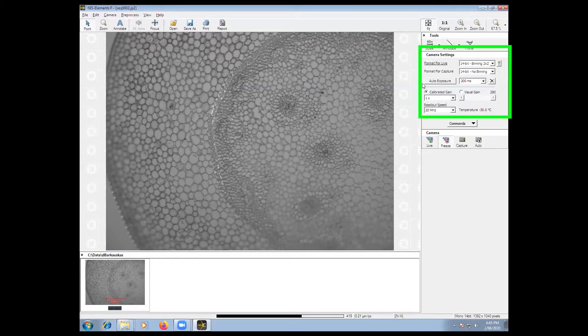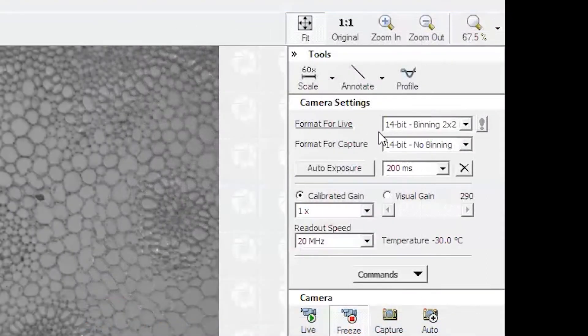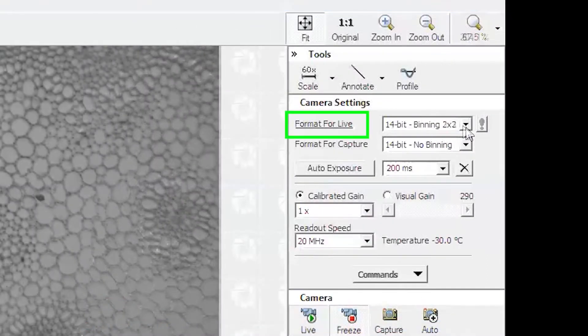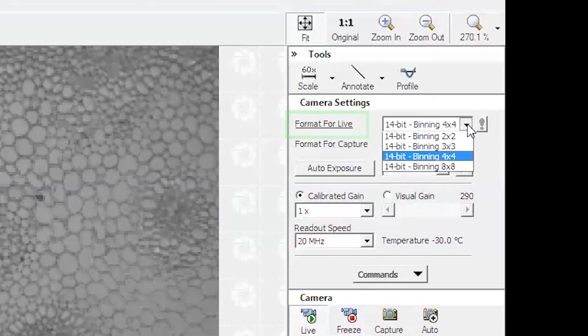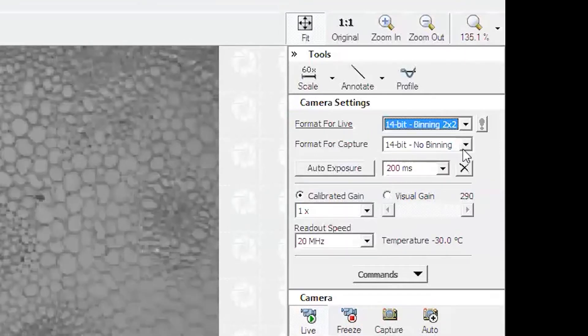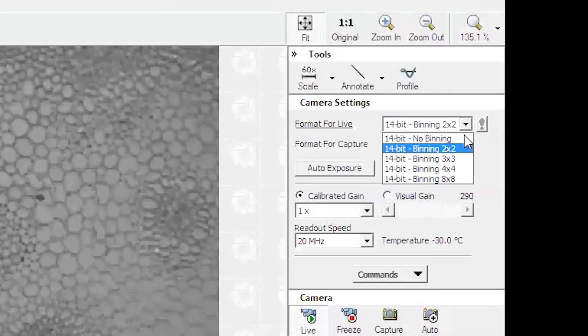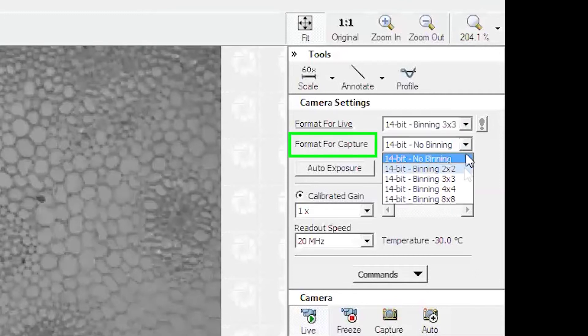Above the camera menu bar you will see other options for the camera. Format for live is a way to collect lower resolution images for quick focusing. Format for capture is for your final captured image.